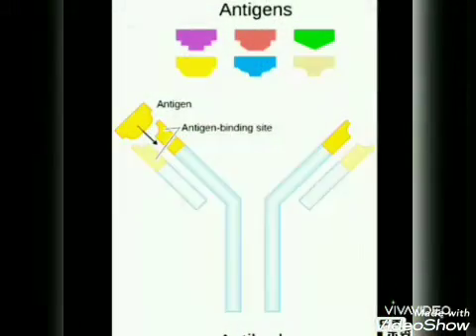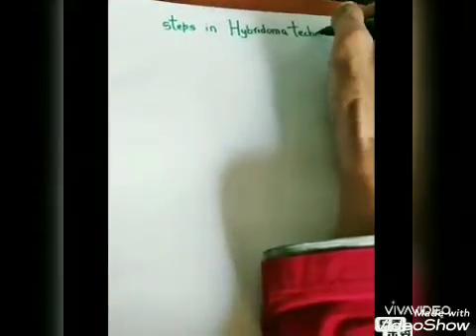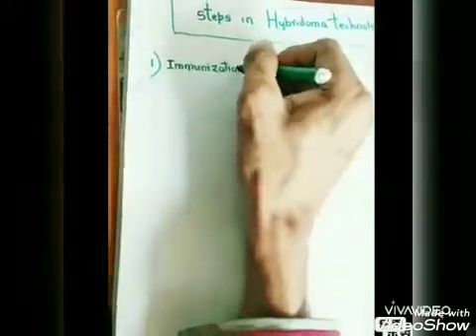Not all the antigens will attach to the same paratope. There is a difference and there is specificity. Now, let us see the steps in Hybridoma technology. The first step is immunization.